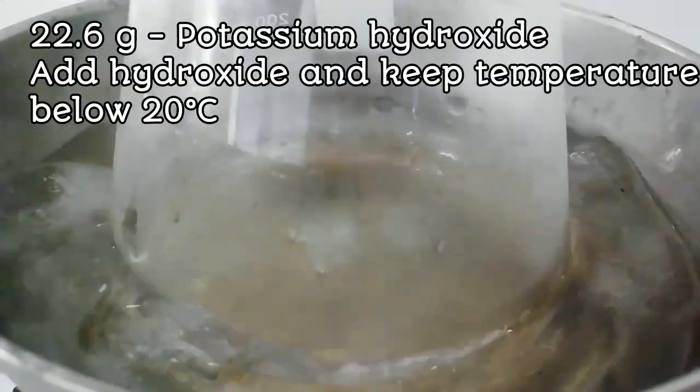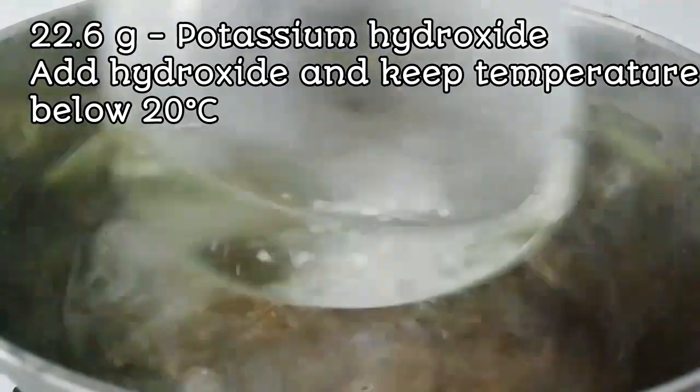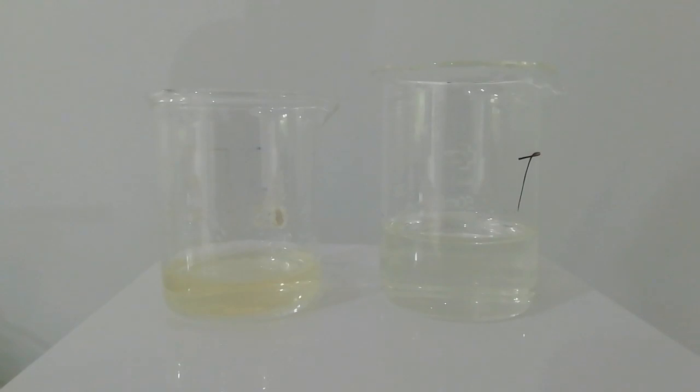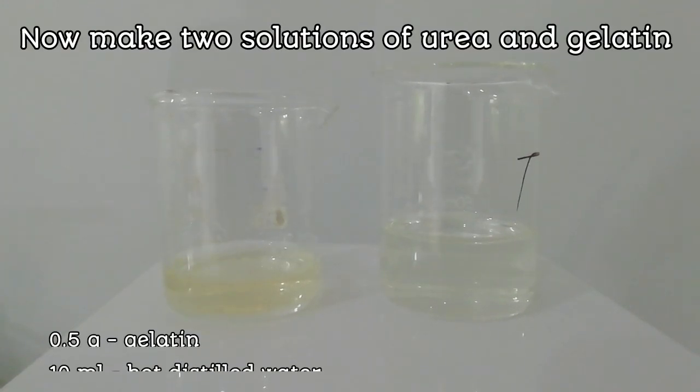Then, 22.6 grams of potassium hydroxide is added to the solution while stirring continuously. In this case, keep the temperature below 20 degrees Celsius.